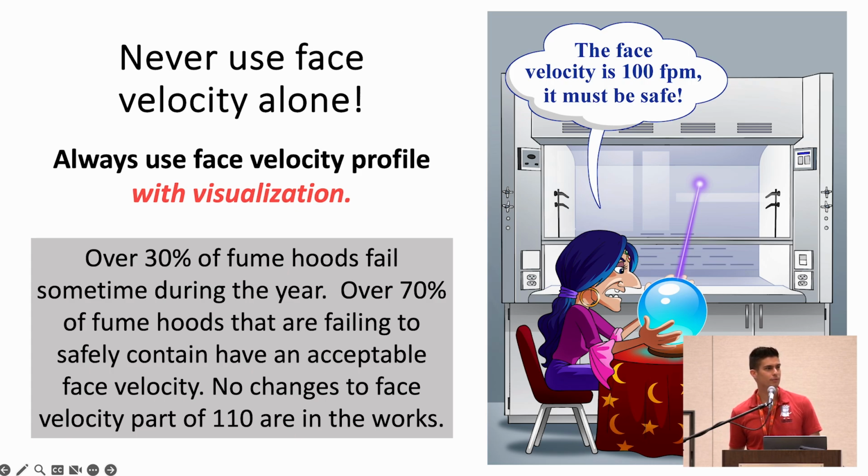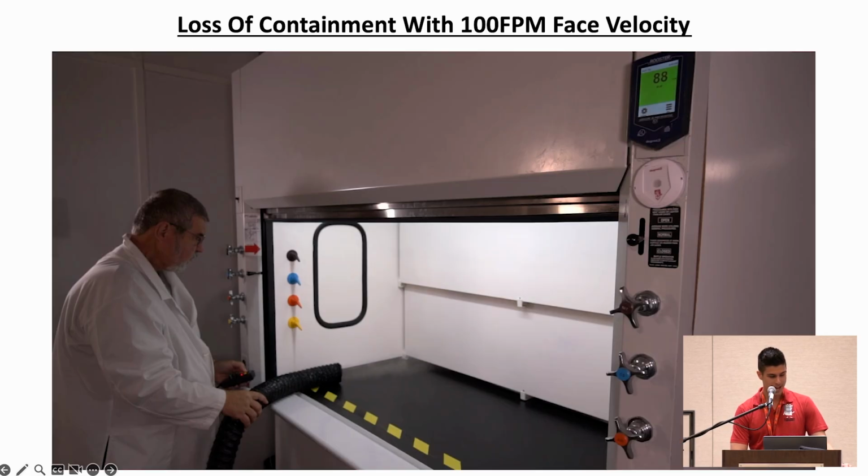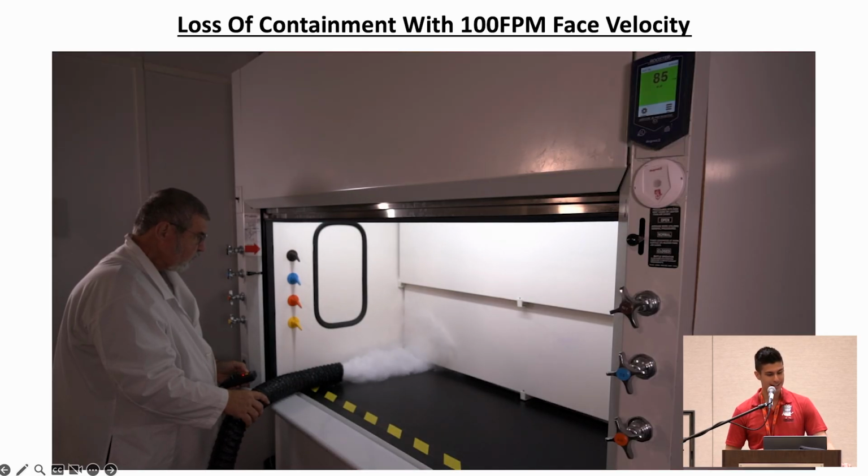This is so cool. Tell me about testing. How do you test your fume hoods? Just use face velocity. Oh, that's very nice. That kind of hurts our heart, though, because we have very many war stories that probably Victor will tell you about. That's not the whole part.